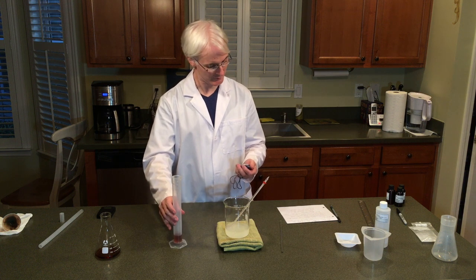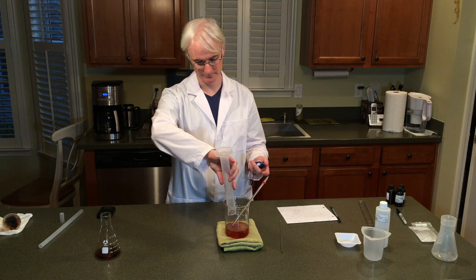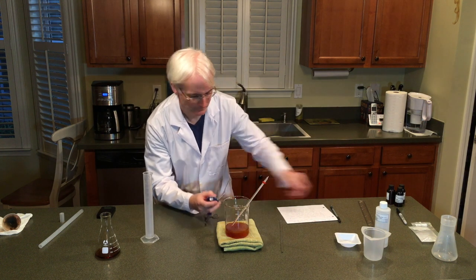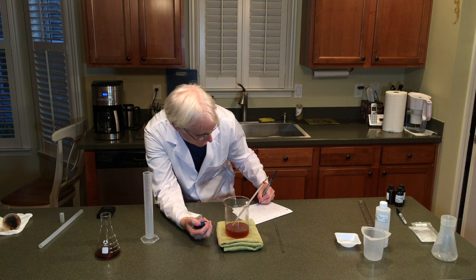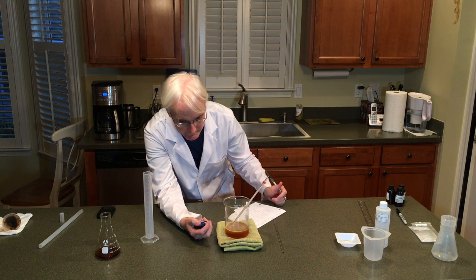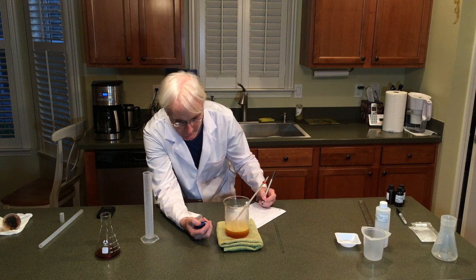So we are ready to go. You're going to keep going until you see the color change. 15 mils in — timer on. And 10. You can hear it fizzing — that's the carbon dioxide being released. And 20. This fizzing is perfectly normal. And 30. And 40.